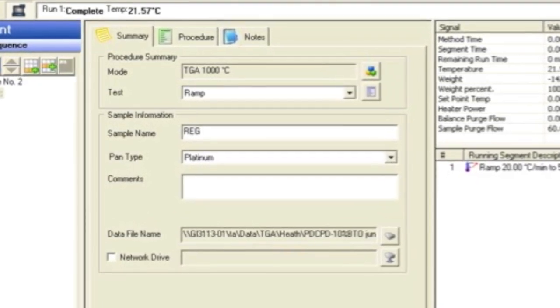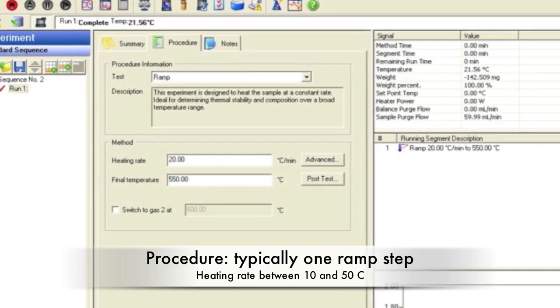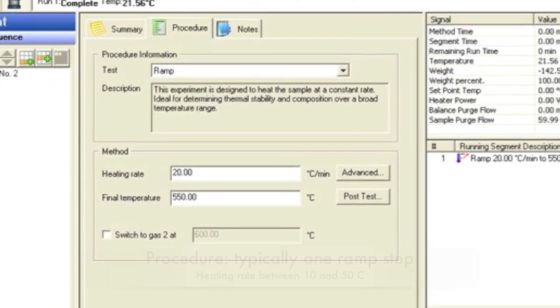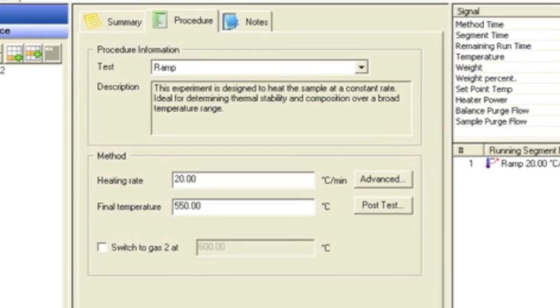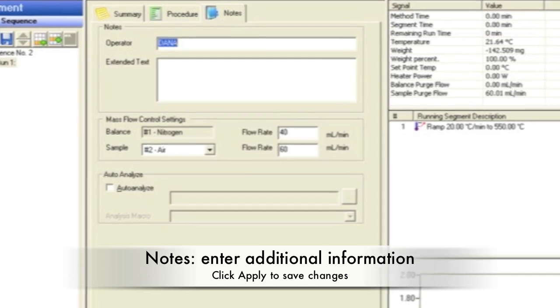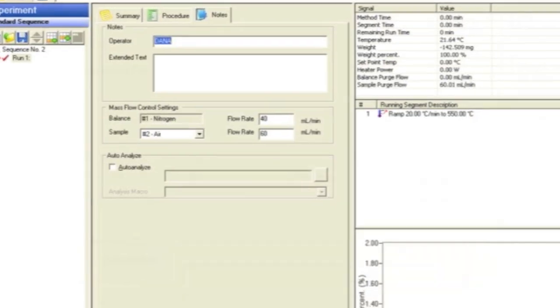Platinum is the most common pan type. Name your sample, add any comments, and save your file in your own named folder under TGA. In the Procedure tab, specify the test, which is usually a one-ramp step. Enter your heating rate, which is usually between 10 to 50 degrees C, and specify your final temperature, which can be no higher than 1000 degrees C. In the Notes tab, enter your name and any additional information. Click Apply after your changes have been made.